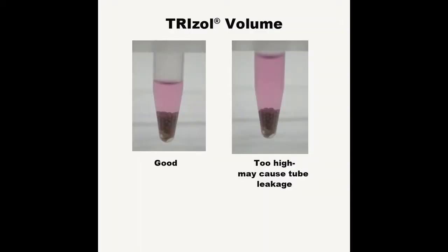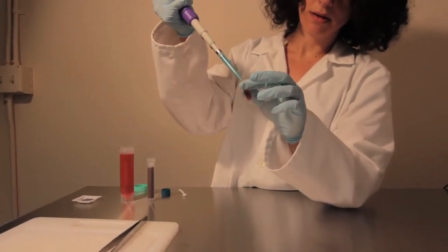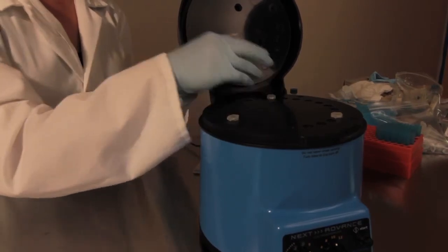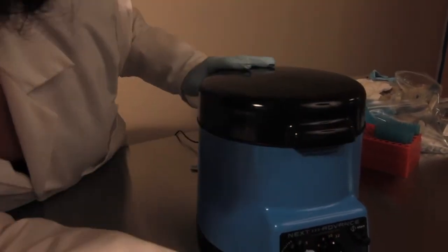Large volumes of TRIzol may overload the tube, causing leakage. We recommend using a volume of TRIzol no larger than 500 microliters for your homogenization in the bullet blender. If your sample size is larger than 50 milligrams, homogenize your sample in 500 microliters.